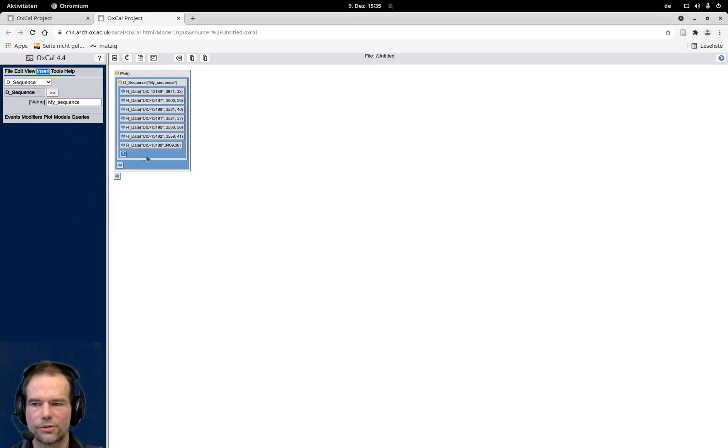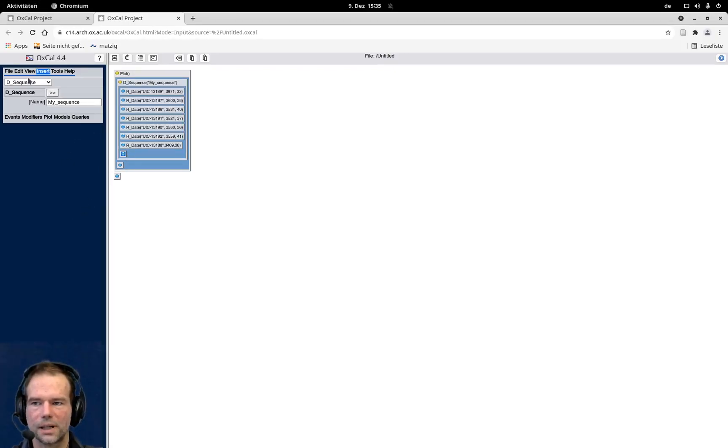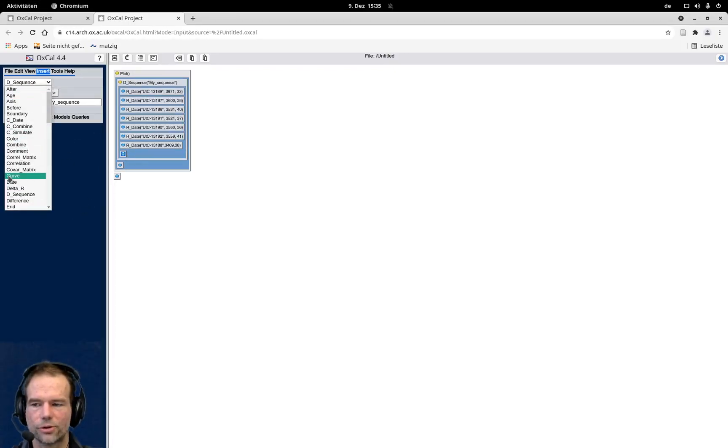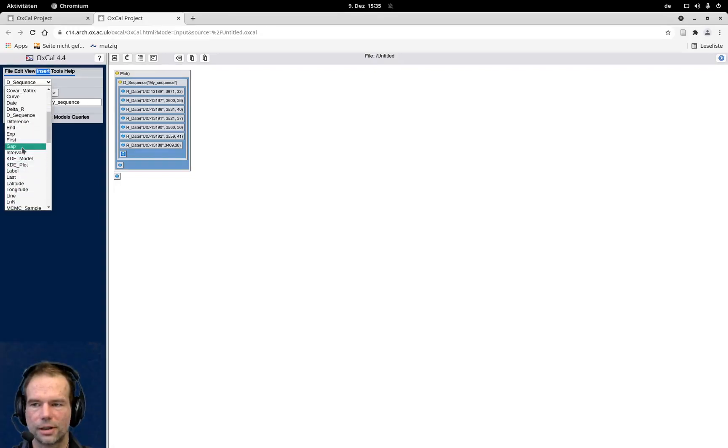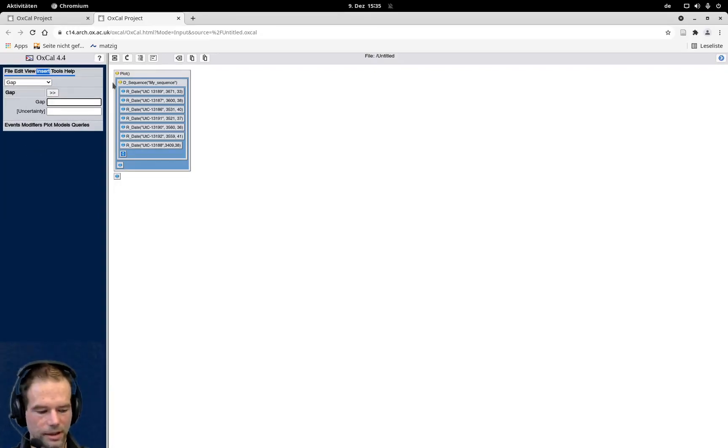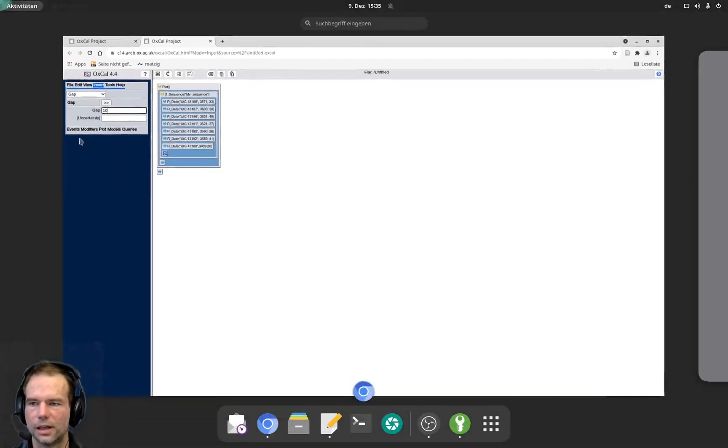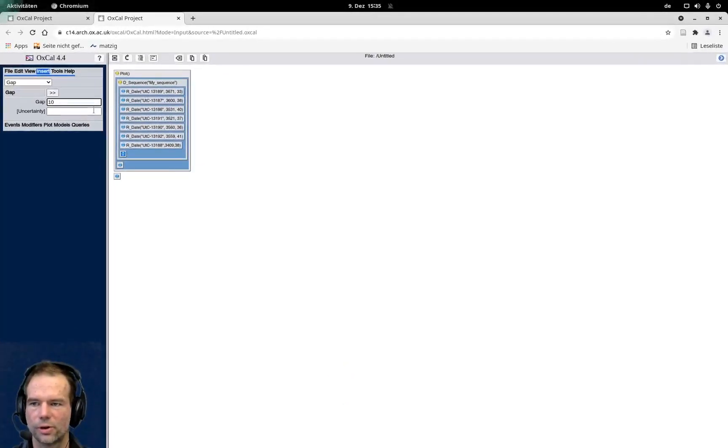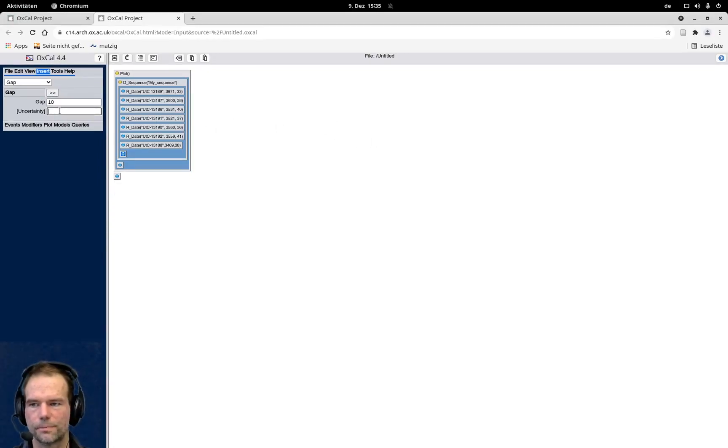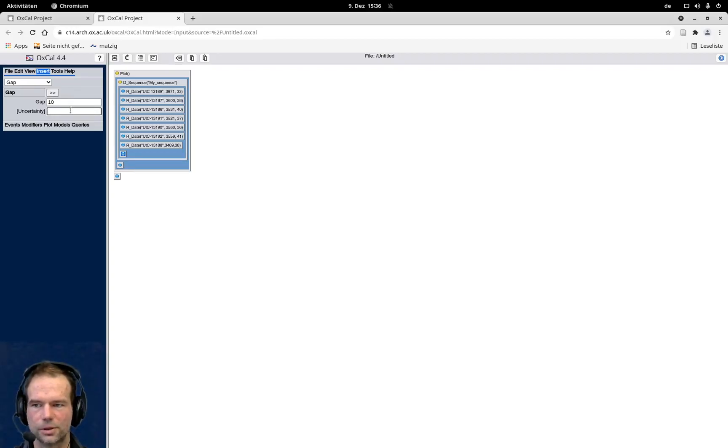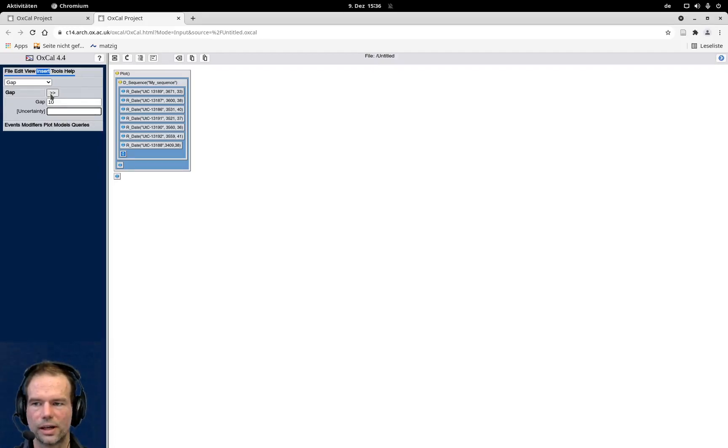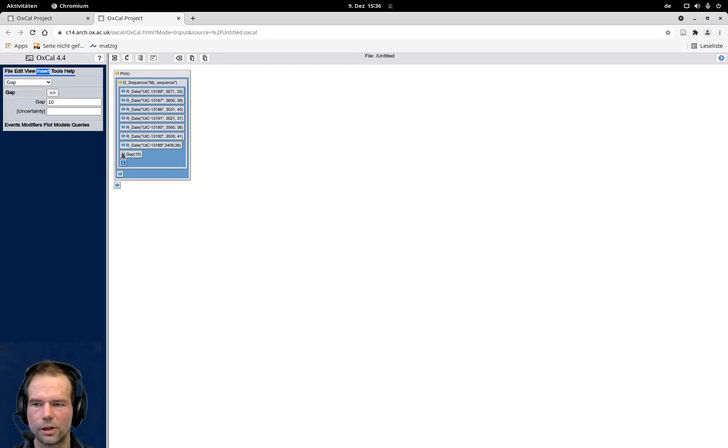To introduce one of these gaps, I can select here from the insert the function gap. Here I have to specify how big the gap is. I go for 10 years. And you can also add an uncertainty for your gap. I'm totally certain because these are tree-ring counts, so I just go for that. But you can also add here a value specifying the uncertainty if you would have some in years.